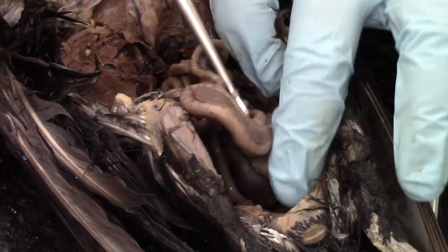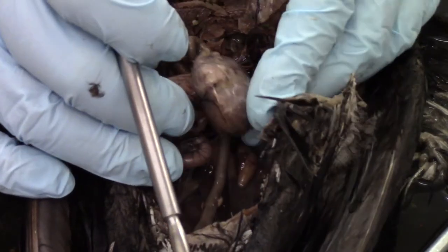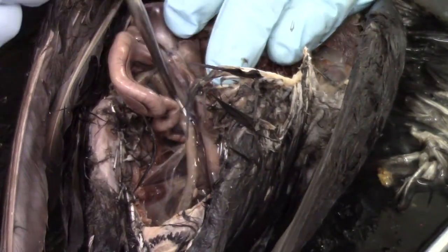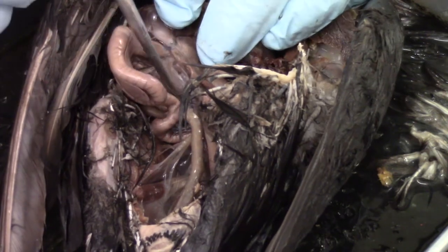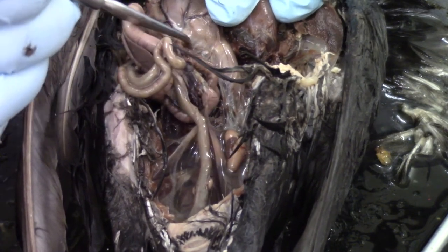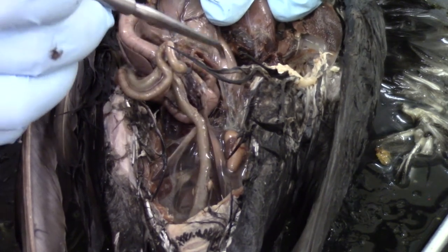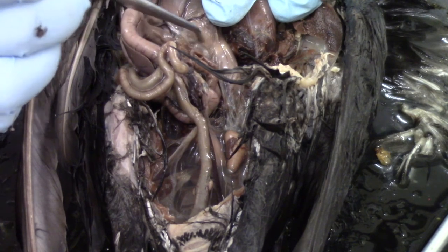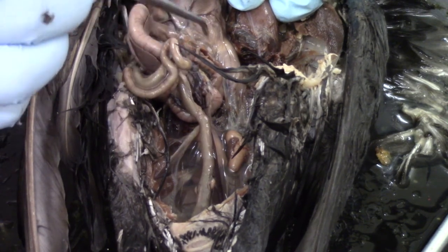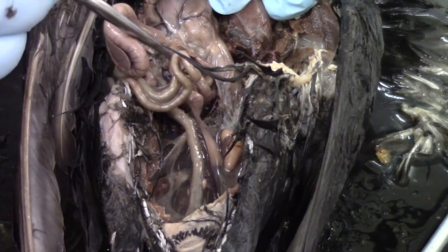One last structure to find: if we move the intestines and gizzard up and to the right, we should be able to find a spleen. Usually the spleen is very dark in color, though this one is showing up as a lighter color for some reason. It should be roughly bean-shaped and will show up right underneath the gizzard. I believe our spleen is just not quite its typical color in this bird.